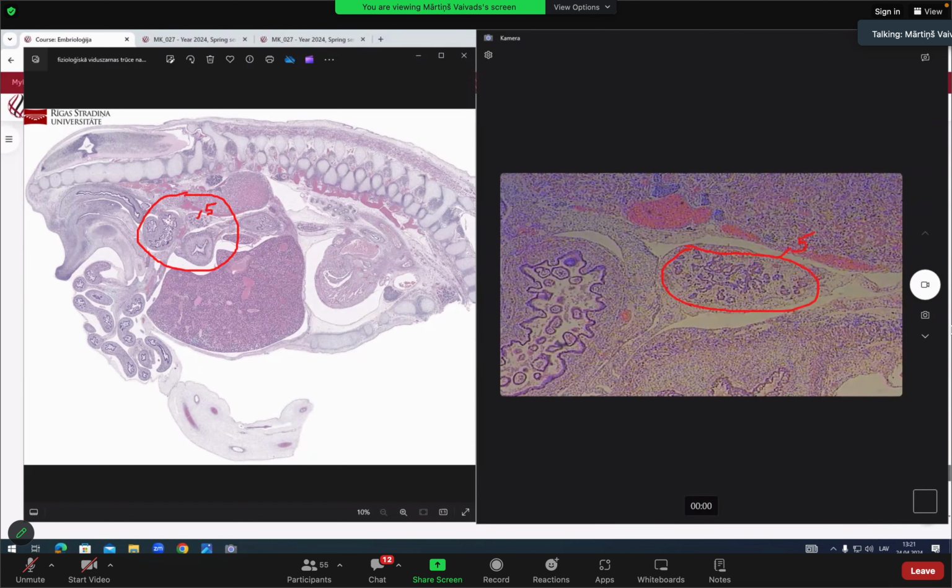Then let's move out a bit more. I'll use this delete function. Let's move a bit further. I will label 2 organs here, 6 and 7, and I will move through the microscope also a little bit.